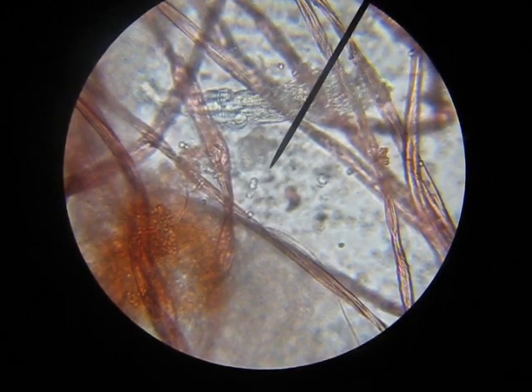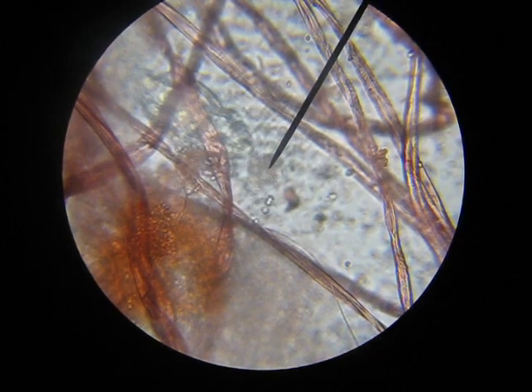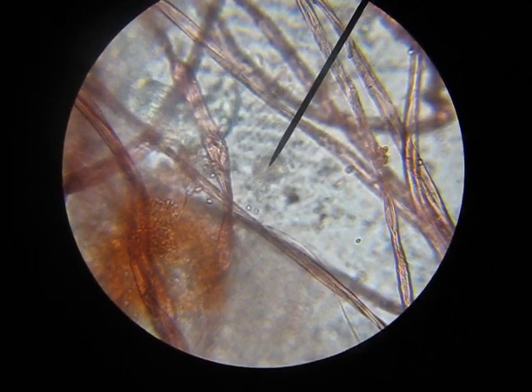It looks like maybe it's eating. I think that is what it's doing. What do you think? It certainly looks like evidence of it. Right there, it's taking it in. Yeah. Does it take in and expel from the same spot?